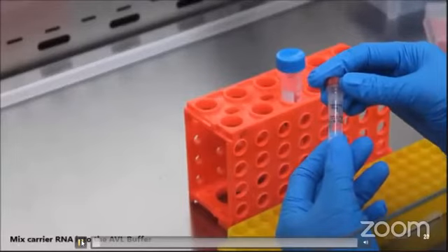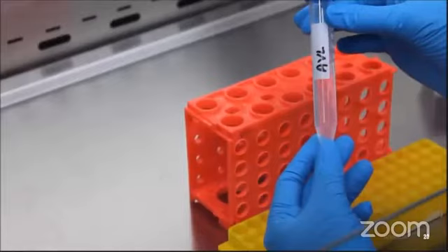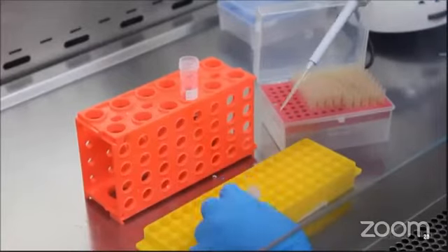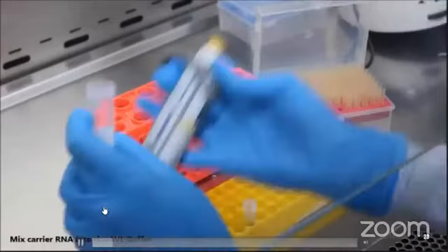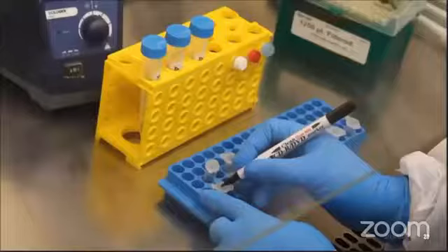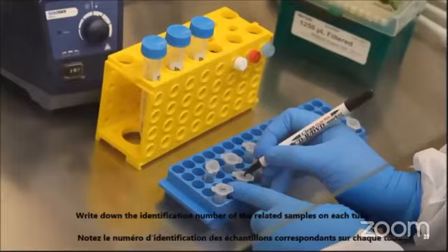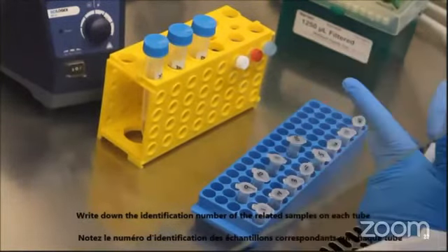First of all, mix the carrier RNA into the AVL buffer. Initially, calculate the number of samples and the amount of carrier RNA which need to be added into the AVL buffer. Write down the identification number of the related sample on each tube.